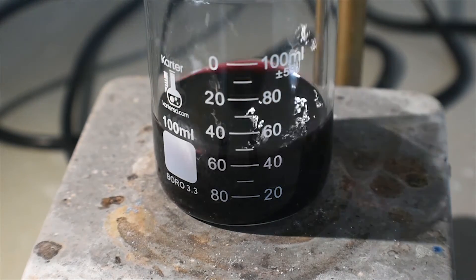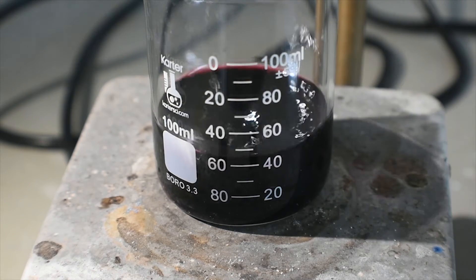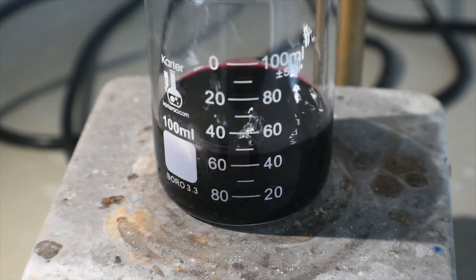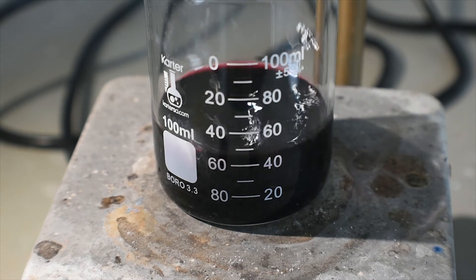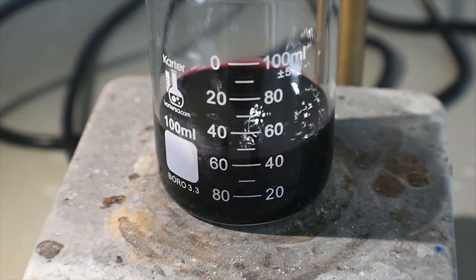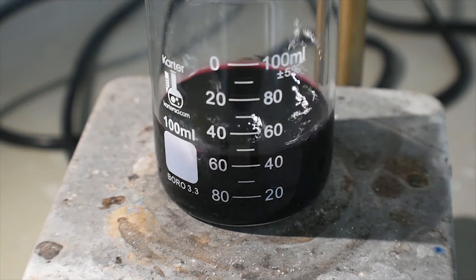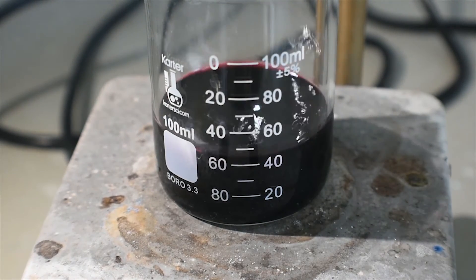Now I'm going to measure out about half a liter or so of just hot tap water and set it off to the side. I'm going to put that in the microwave if I need to, just to use as a source of gentle heat for this reaction. I probably won't use all of it, but it's just good to have a large amount in case. I'm going to leave that in the microwave until I need it.